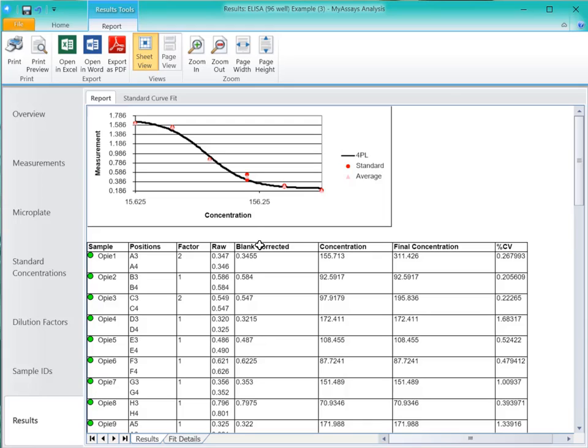The raw results, and then the results of our data calculation, which include blank corrected, the interpolated concentration, the final concentration, which takes into account the dilution factor, and the percent CV.